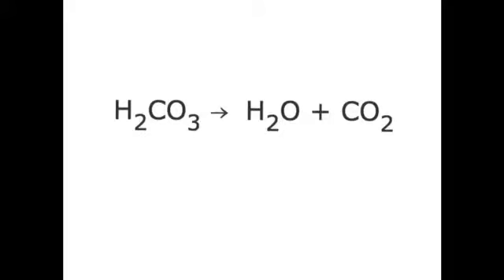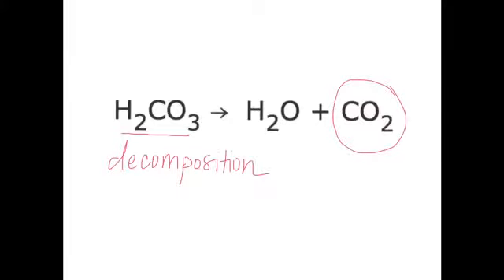So here's the reaction. We have the carbonic acid, which is H2CO3, decomposing, because it's unstable, into water and carbon dioxide. The water you could see because of the liquid that was in the tube, and the carbon dioxide we showed when I demonstrated that the light went out.